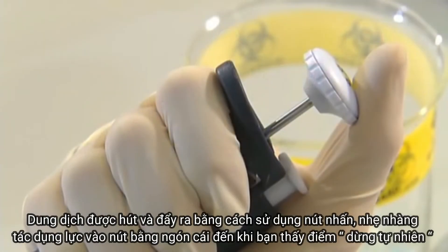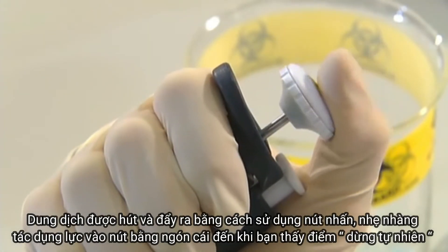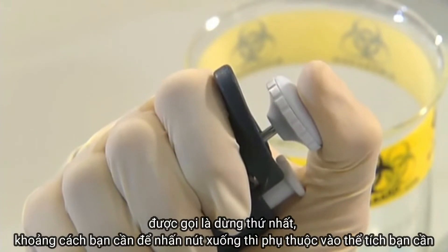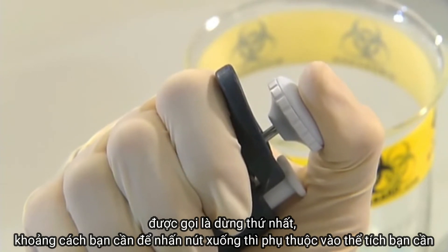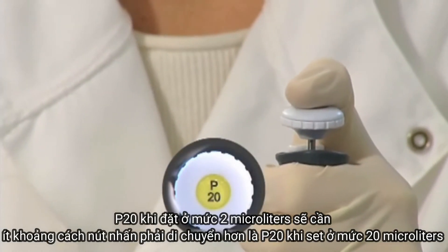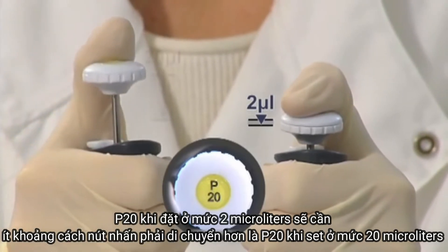Liquid is drawn in and expelled using the pipette's push button. Gently apply pressure to the button with your thumb until you feel a natural stop — this is called the first stop. The distance you need to push the button down will vary depending on the volume you require; a P20 set to 2 microlitres will require less push button movement than a P20 set to 20 microlitres.